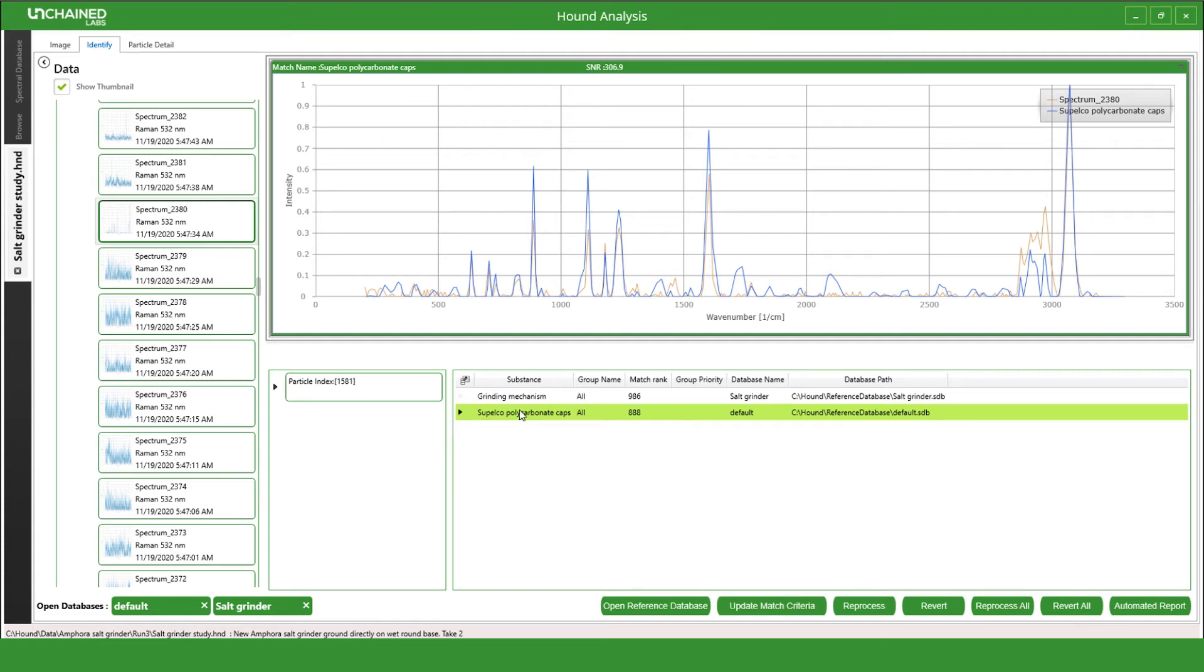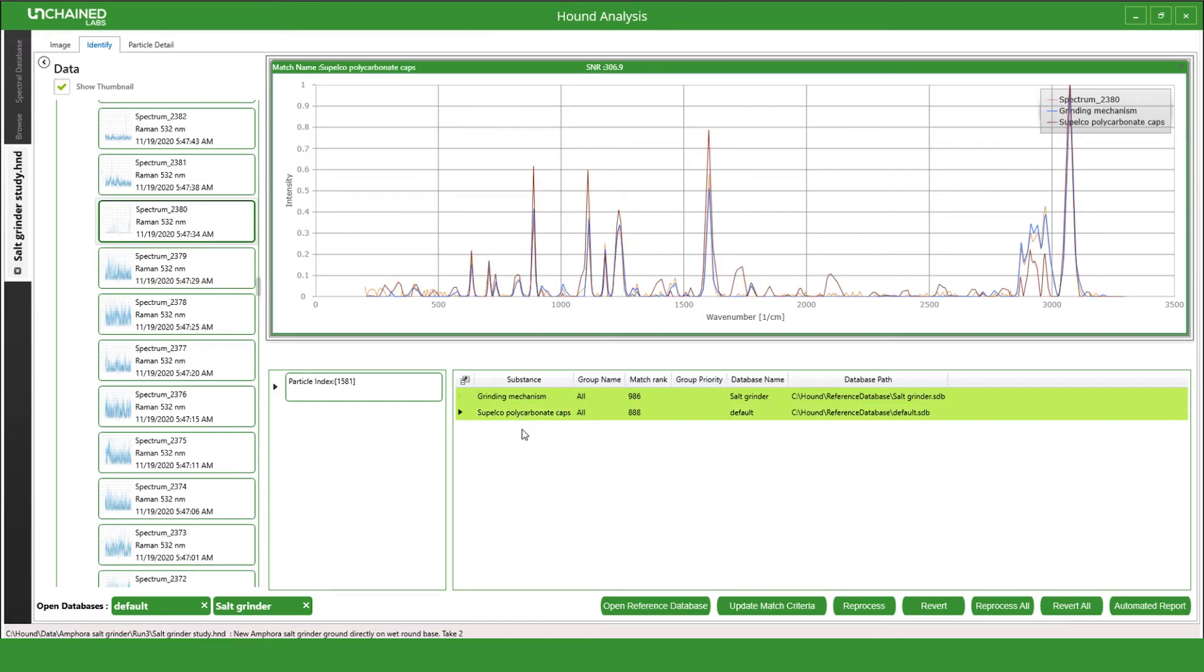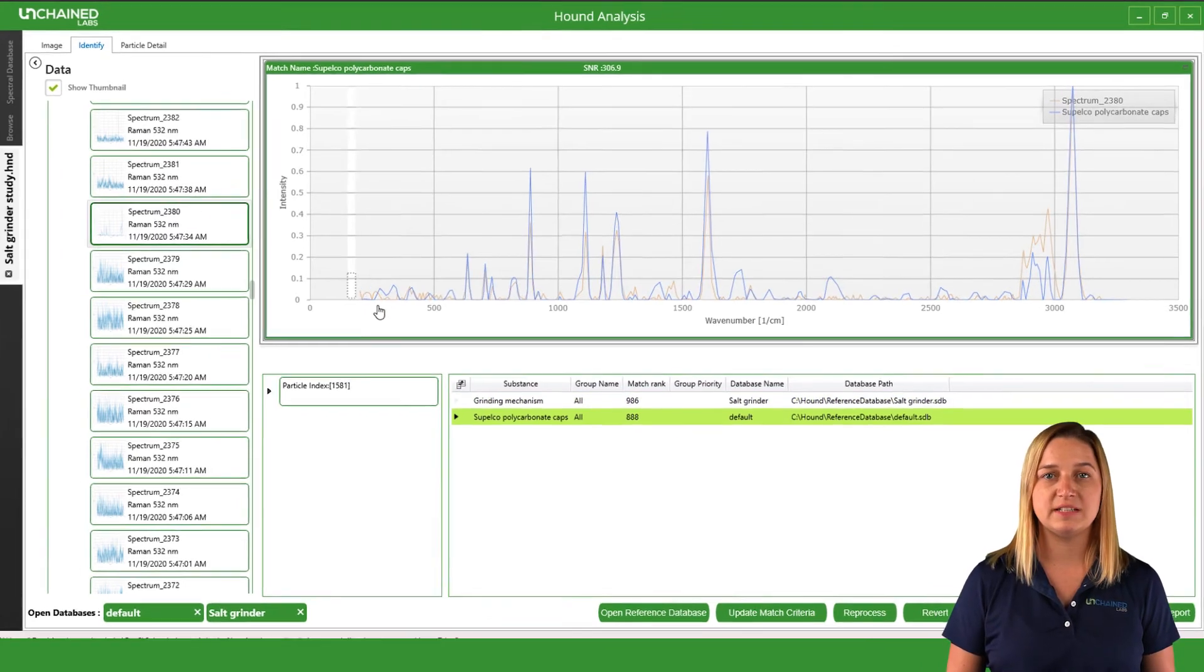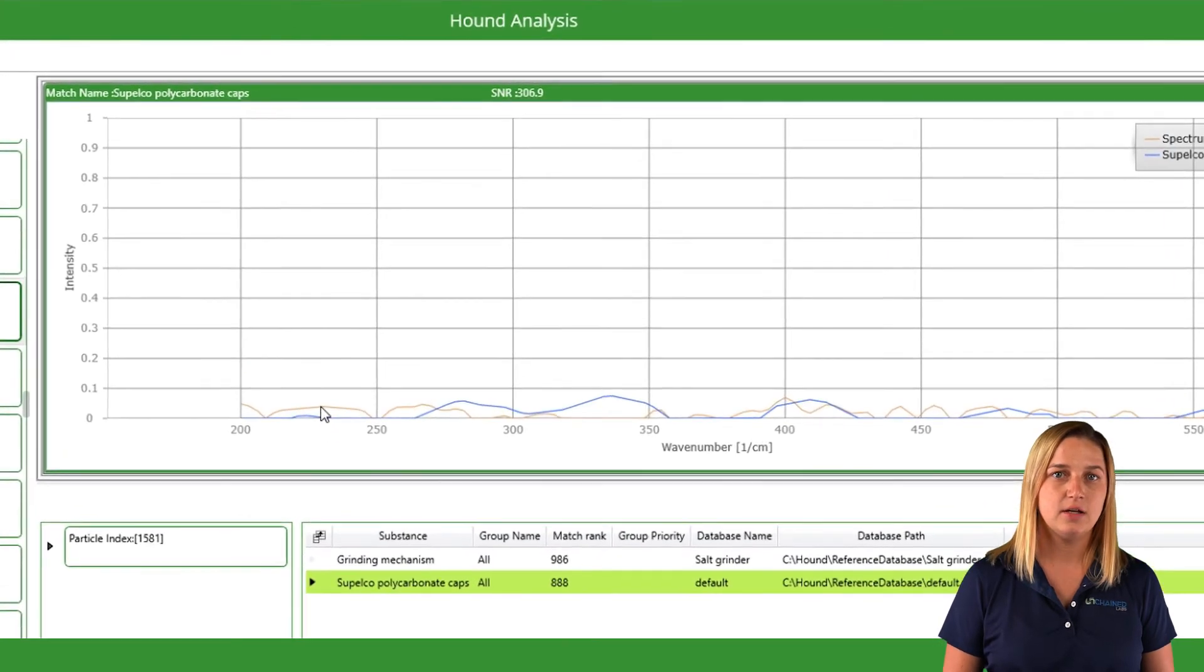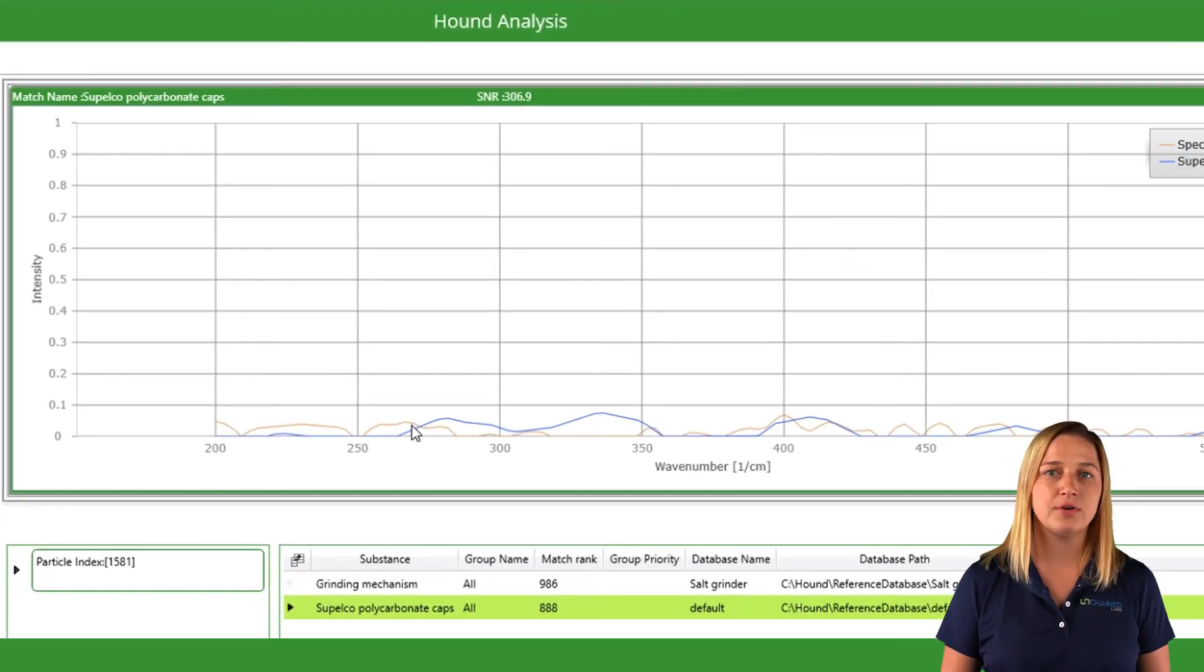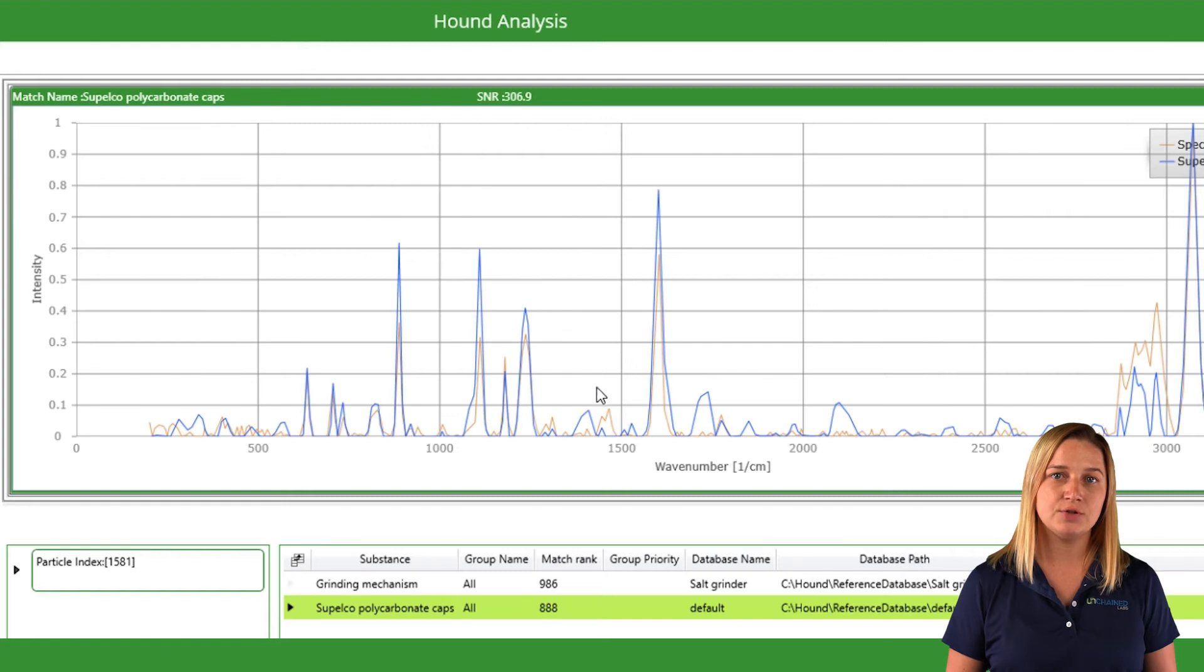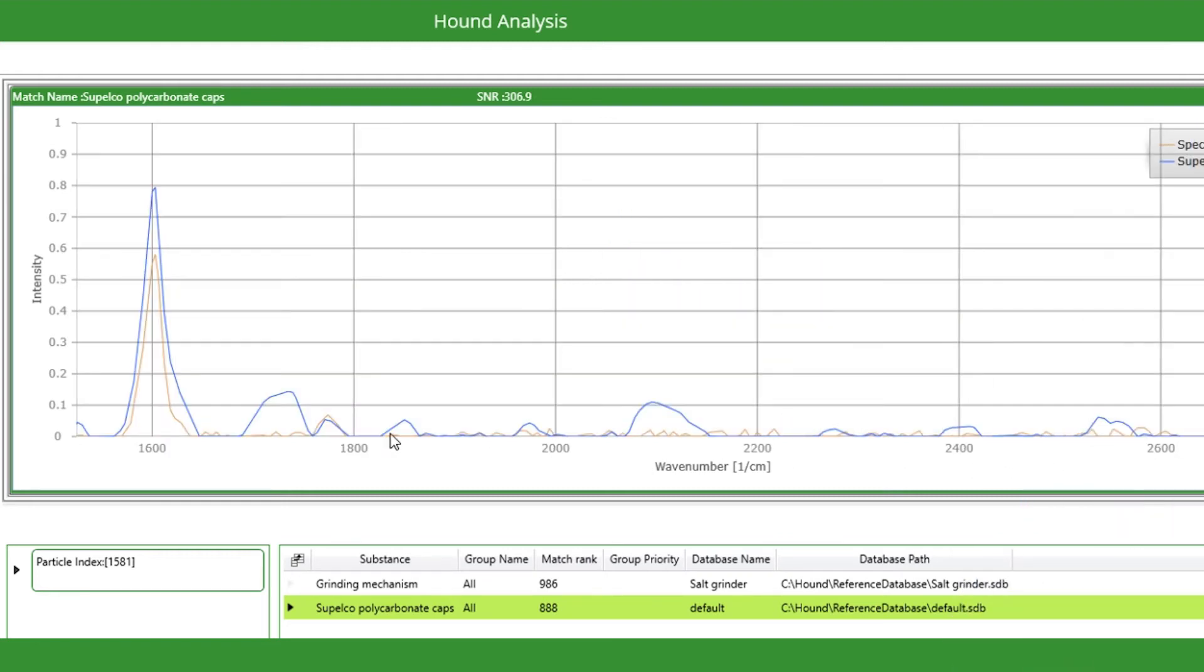To get even more specific, we can look at that custom reference I just made and see these polycarbonate particles are definitely from the salt grinder. The generic polycarbonate Raman signal differs from the grinder-specific polycarbonate in a few places. For example, look at around 300 wavenumber and between 1700 to 2800 wavenumber. Each peak provides information on the chemical bonds present in our sample, so these spectral differences reflect physical differences between the materials.